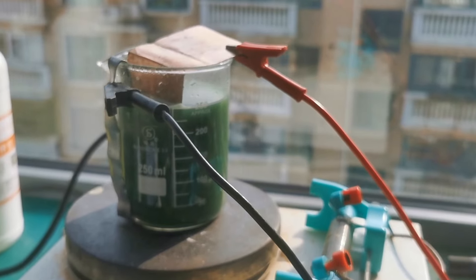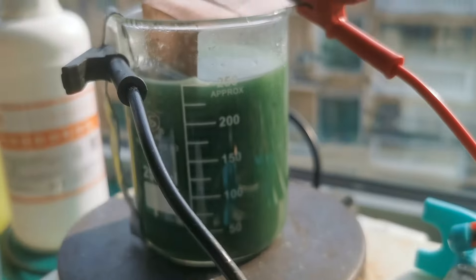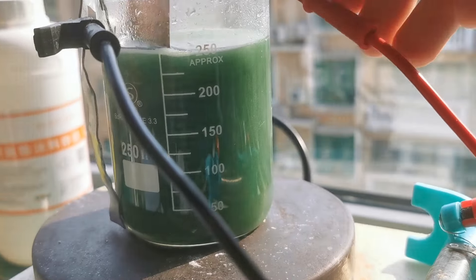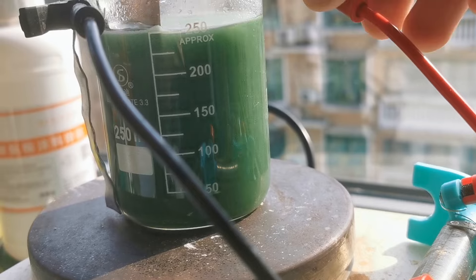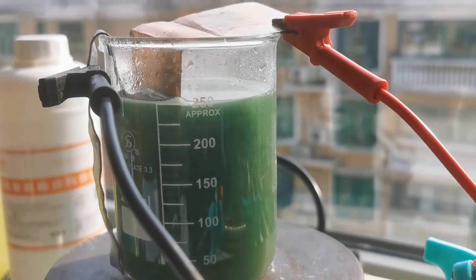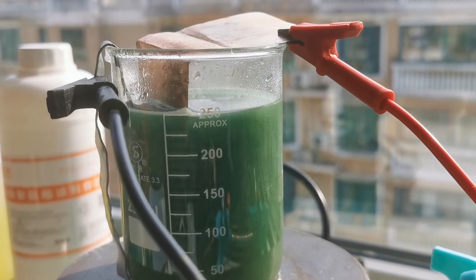As the electroplating proceeded, more and more hydrogen bubbles were produced on the copper cathode and there were no visible nickel depositions. I tried moving the two electrodes closer to each other, but that didn't work. I realized something was definitely wrong by this point.